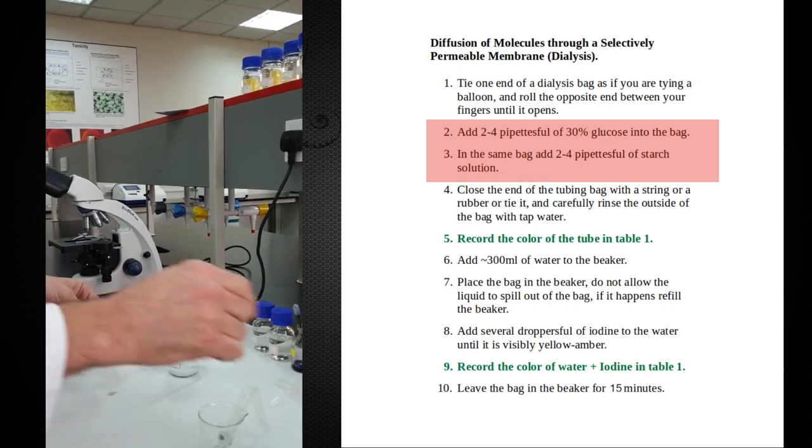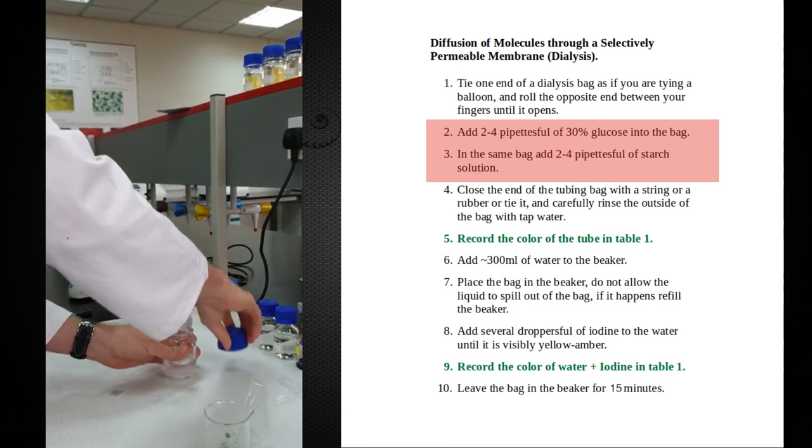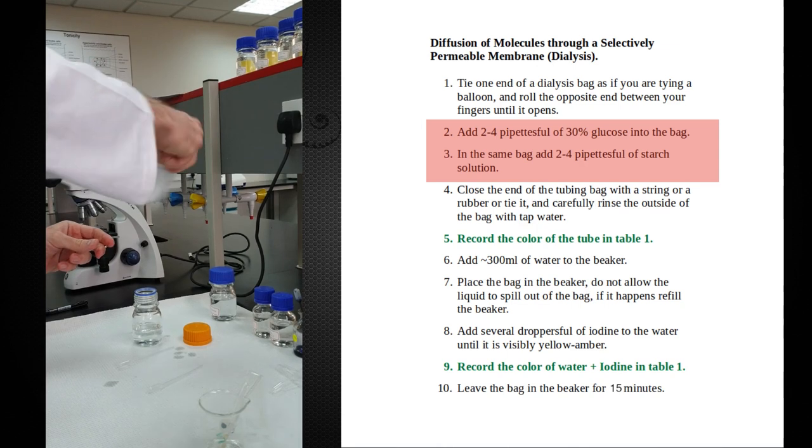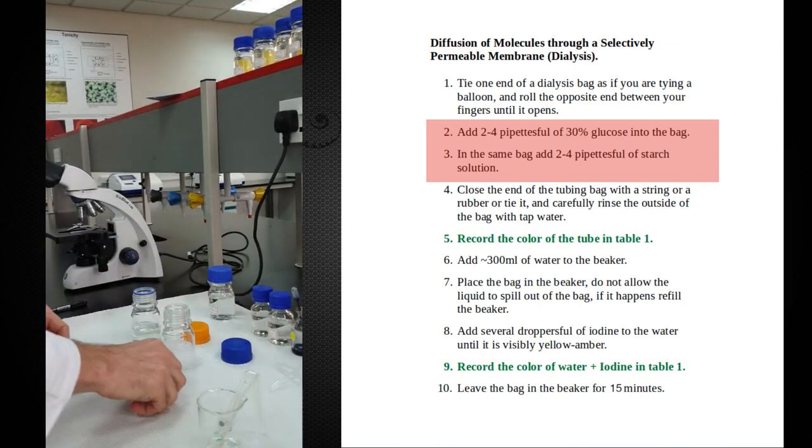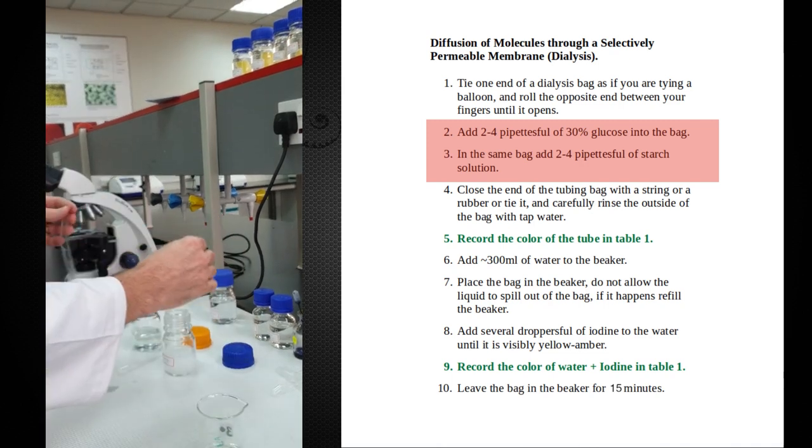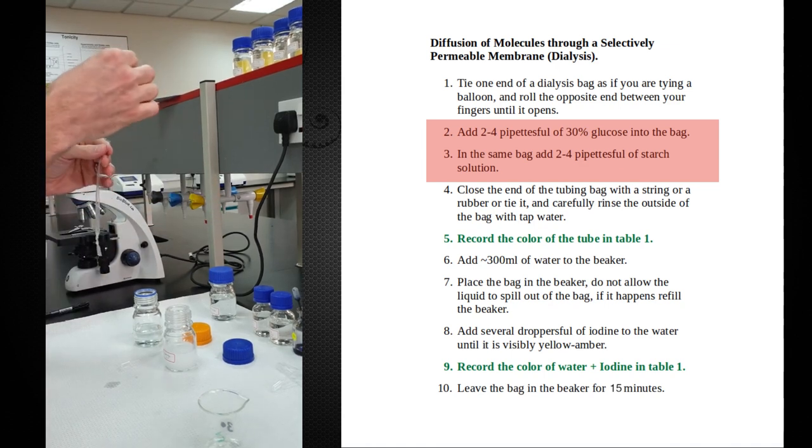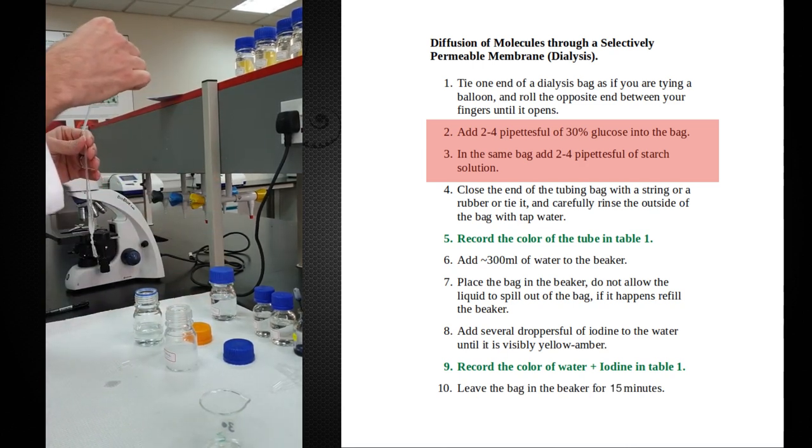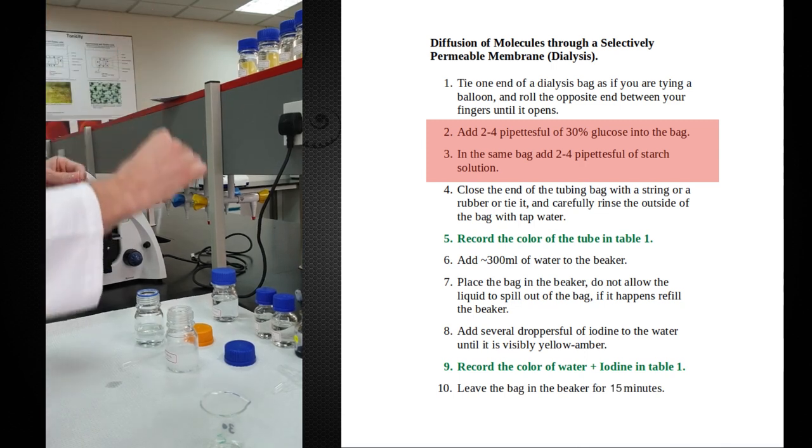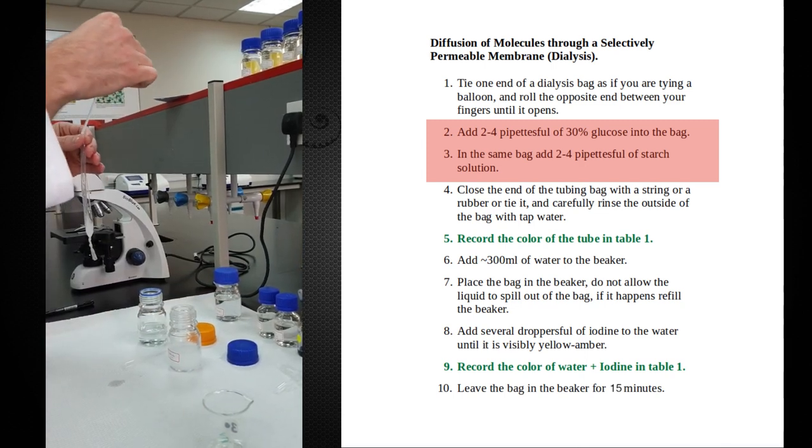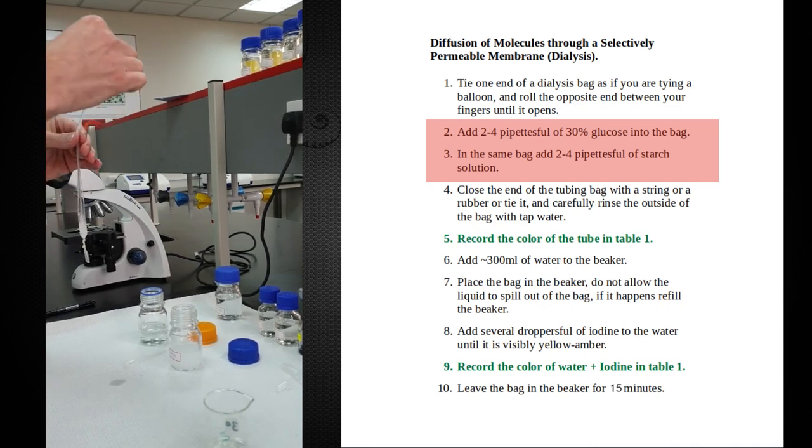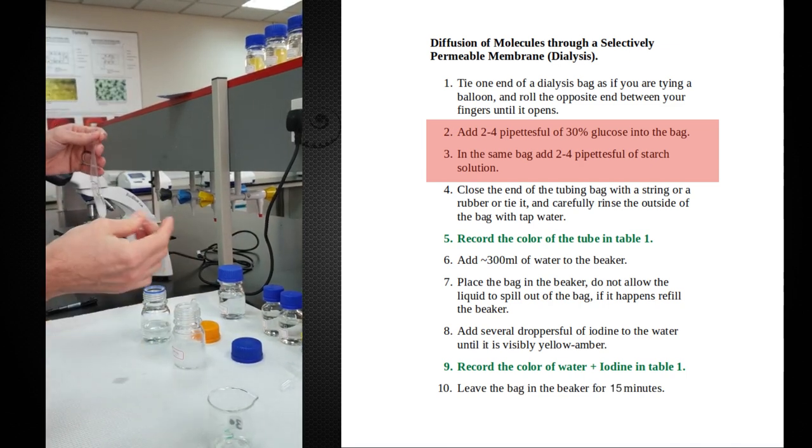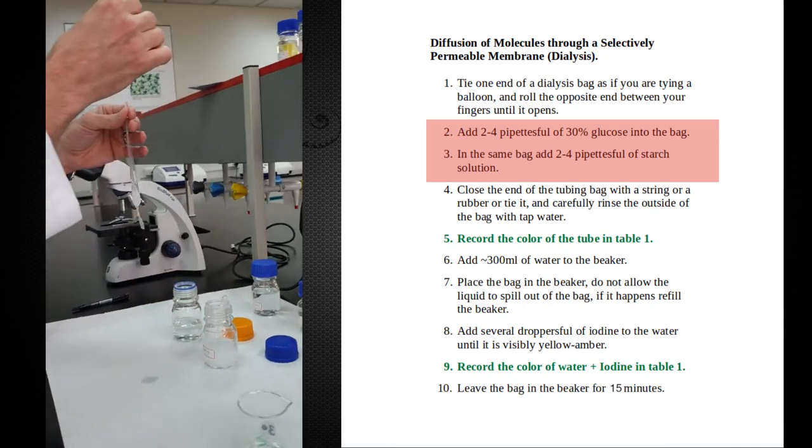Let's just set this down for a moment. Now I've got my bottles. I'm going to take a couple of pipetfuls of each. Again, you don't really have to measure these things. We're not trying to accurately put certain volume in here. Just a little bit here. I'm going to take a couple of pipetfuls to have some sample inside of this tubing. Maybe a little tricky sometimes to get a dropper in there.